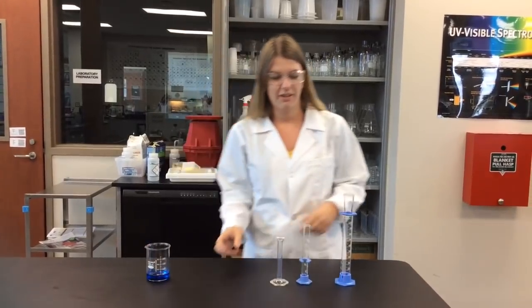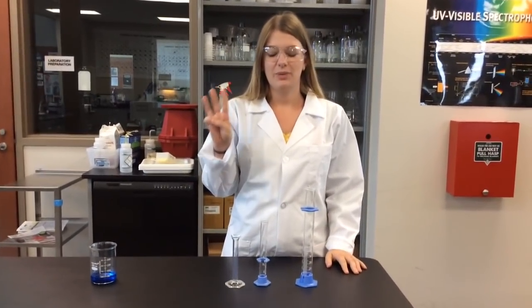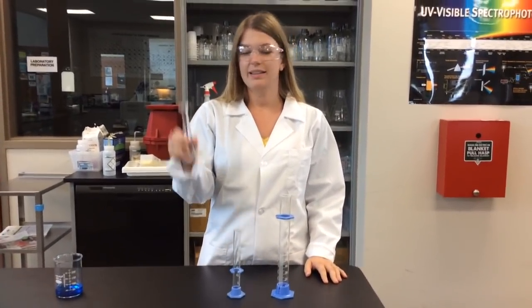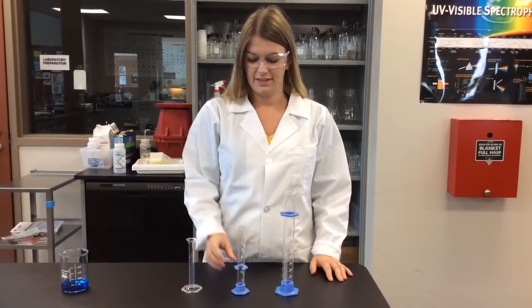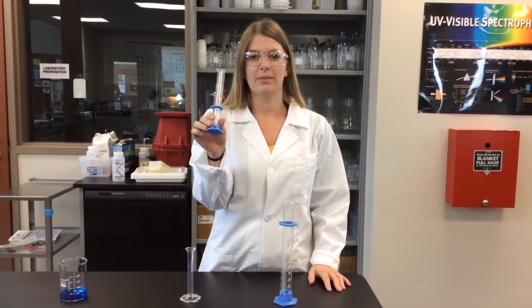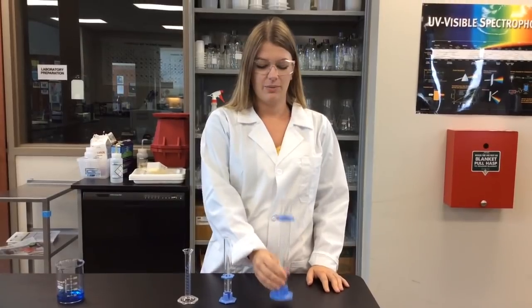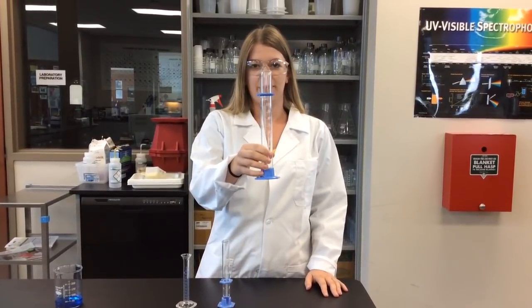Over here, we have three different sizes of graduated cylinder. First one, this is 10 milliliters. Second one, this is 25 milliliters. And the third one, this is 100 milliliters.